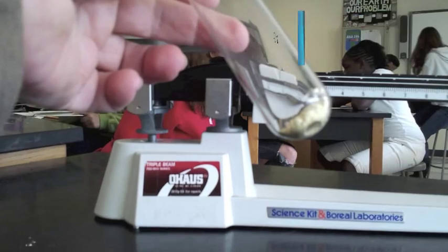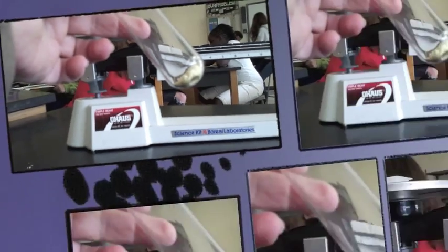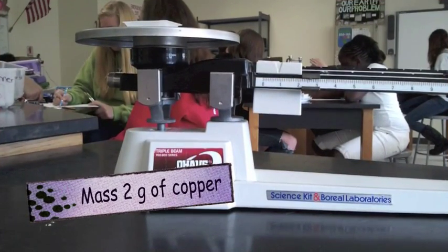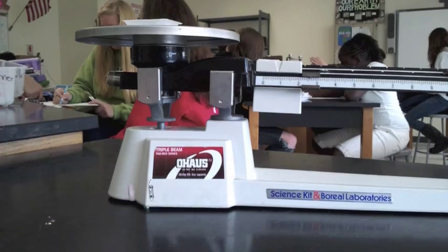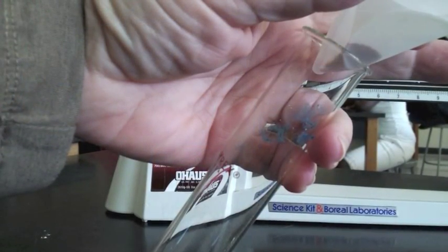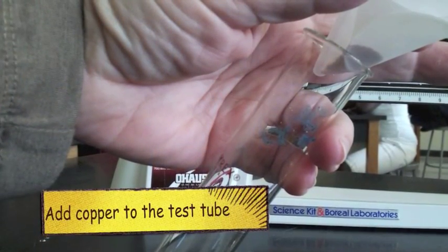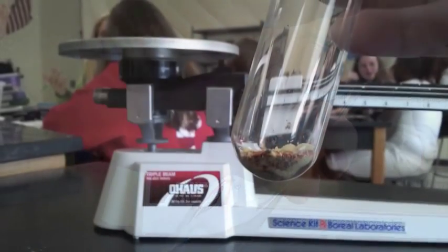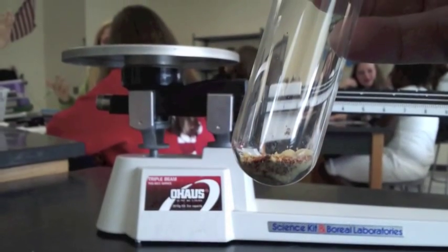Next we're going to mass 2 grams of copper using the boat again, setting the balance at 2.6, and then we're going to add the copper to the test tube with the sulfur.